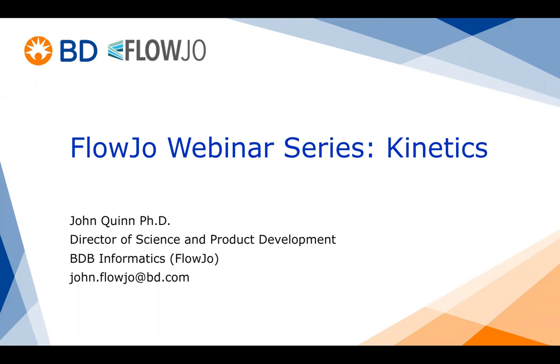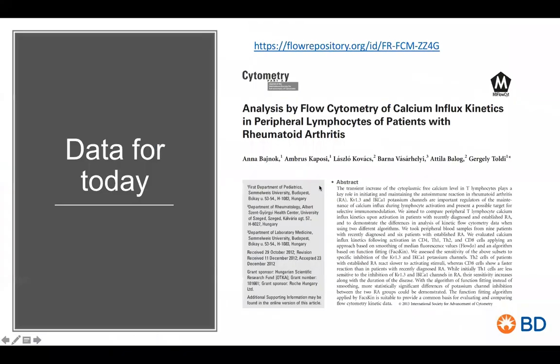So the data set that I'm intending to use for today's webinar, I got from Flow Repository. I wanted to again thank everyone who posted to the Flow Repository. Having good data available for folks like me who like to do data analysis but don't necessarily have a cytometer is an invaluable resource and a great way to cross-validate results and experiments.